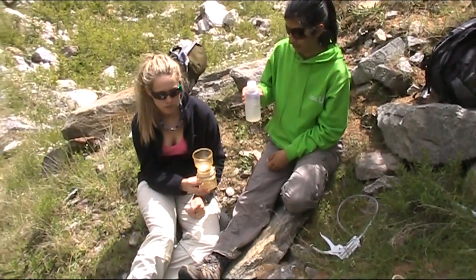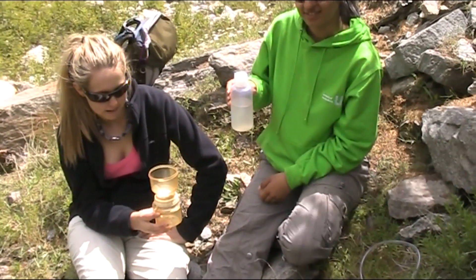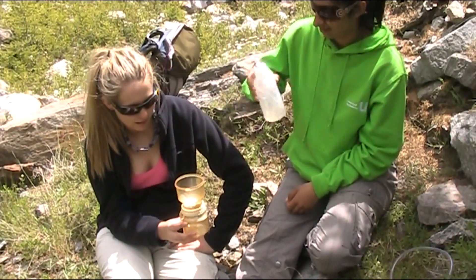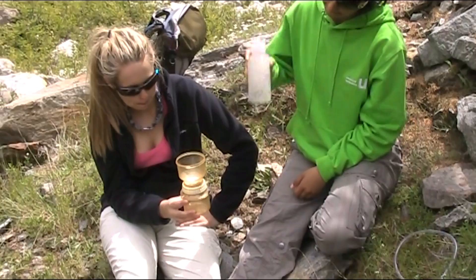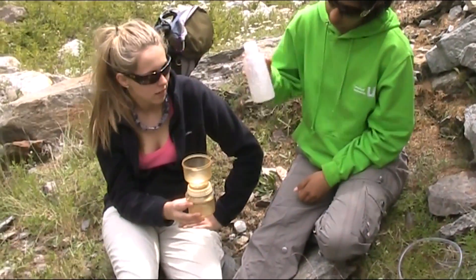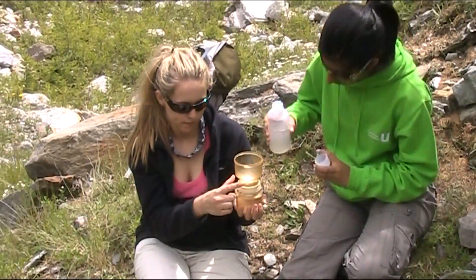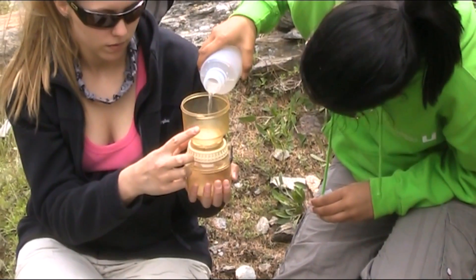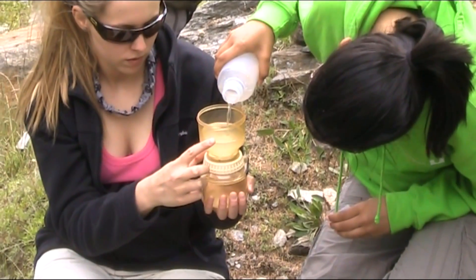We've now got our filter paper secured in the vacuum housing. The next job is to pour a known quantity of our sediment-laden water into the housing. Before we do that, we need to give it a good old shake, because we need to make sure all that sediment is in suspension and there's none left trapped at the base of the plastic bottle. So we give it a good old shake. Once we're confident all the sediment is in suspension, we pour out a quantity into the upper section of the housing. The upper section has marks on it and we're pouring about 200 millilitres. We need to be as accurate as possible here.